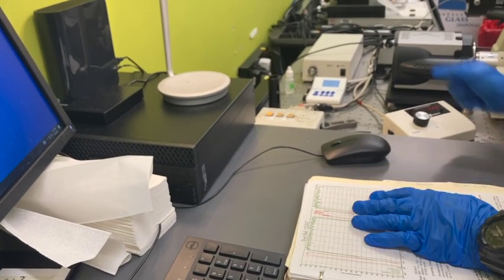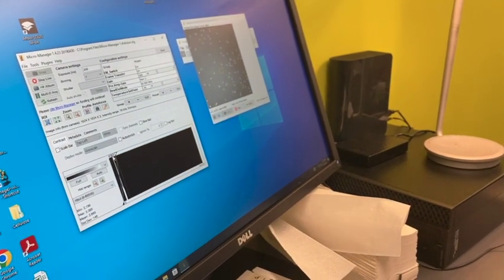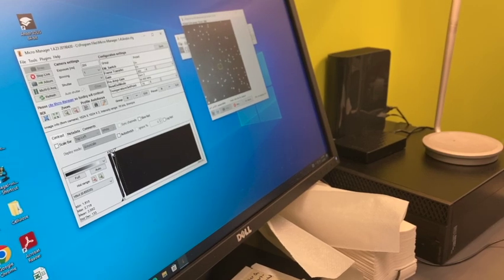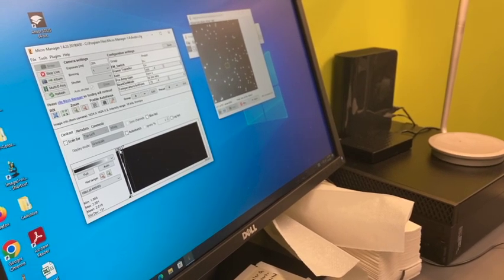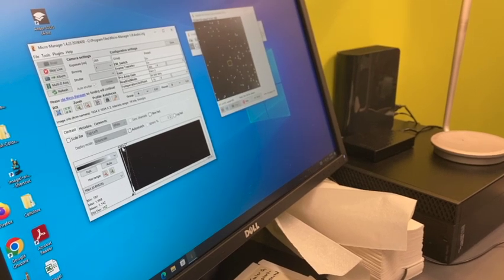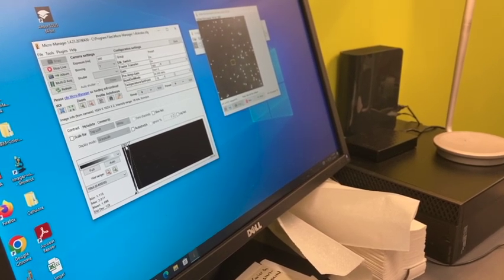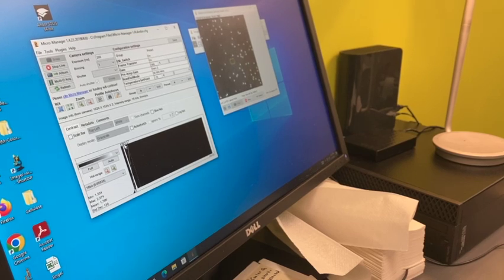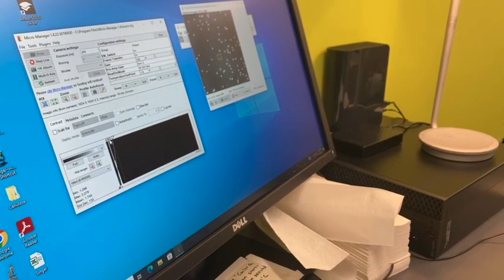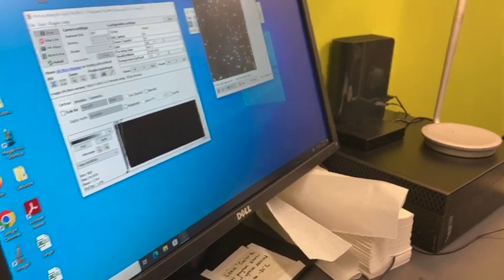So yeah, because there is a certain spot where the signal to noise is maximum. This is best for single molecules, and I need to calibrate and find that sweet spot for TIRF. So that's TIRF.